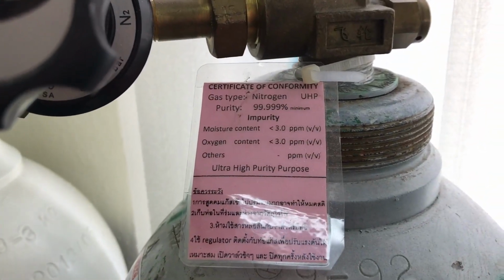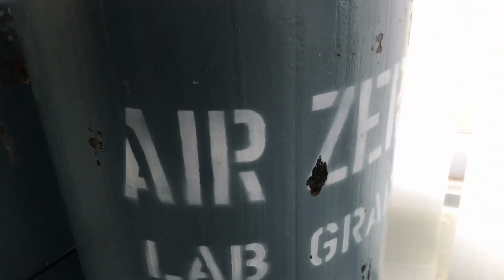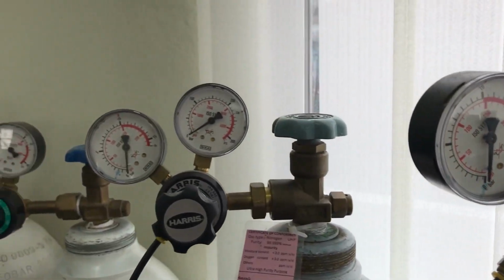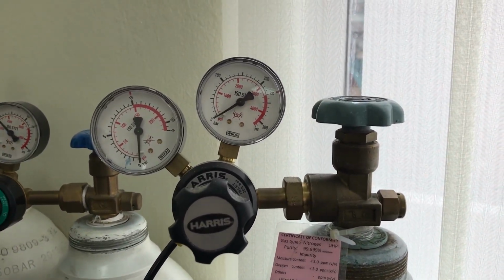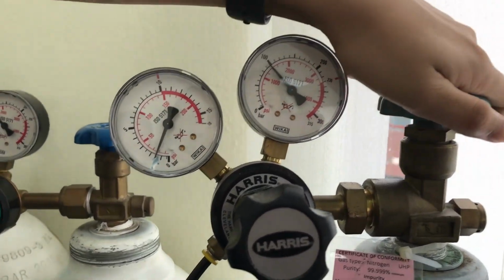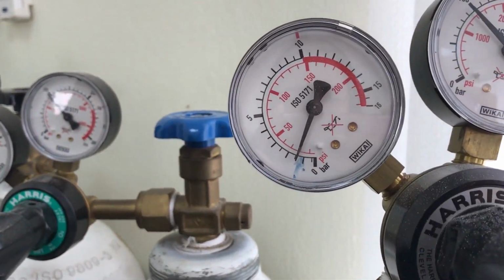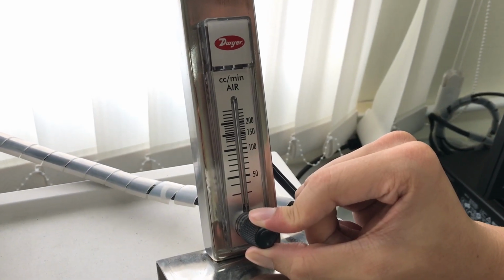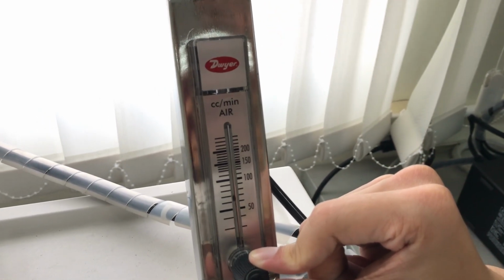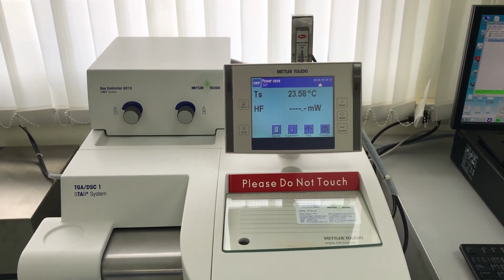In the experiment, we test the sample in two states: dry air and nitrogen. Release the gas from the tank until it reaches blue line. Adjust the exhaust pressure knob counterclockwise on TGA to 50 cc per minute. Wait for 30 minutes to stabilize the machine.